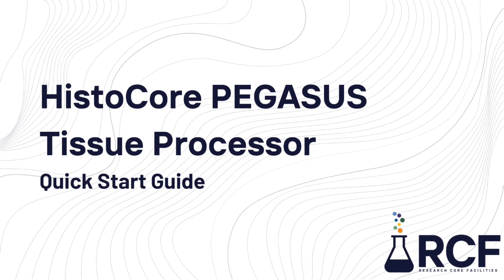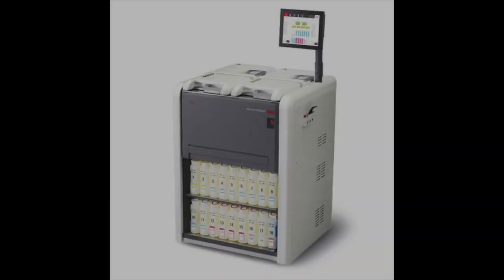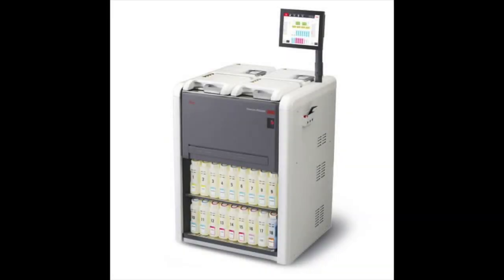This video will show you how to use the Leica Histocore Pegasus Tissue Processor to process your specimens. The Pegasus Tissue Processor is a brand new tissue processor, which was launched by Leica in May of 2022.